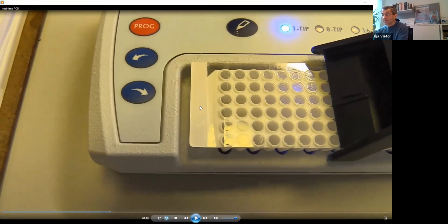Then the next step, you cover the whole PCR tubes with a special foil, which is very important to seal properly. That means that you should have a very good contact between the top of your PCR tubes and the foil, because the temperature is very high, it runs up to 99 degrees, and it would evaporate.